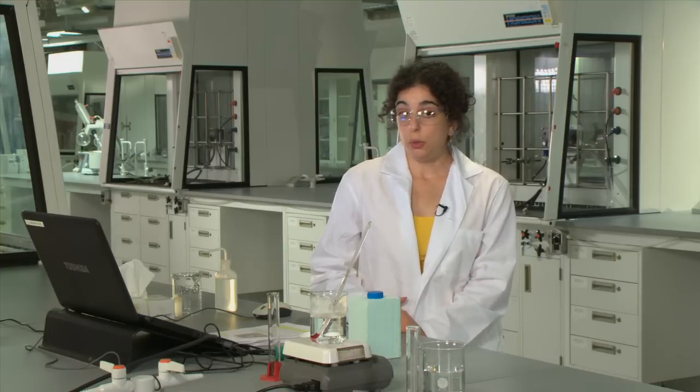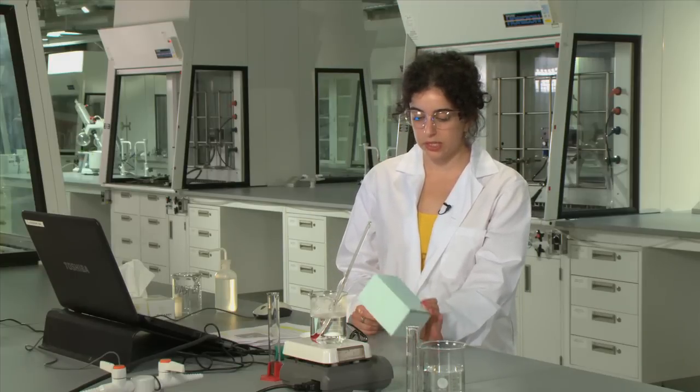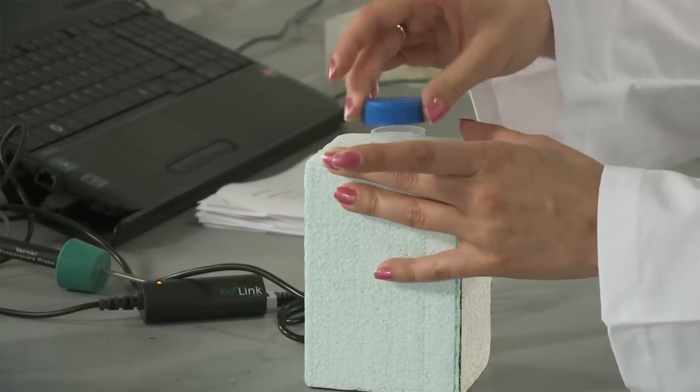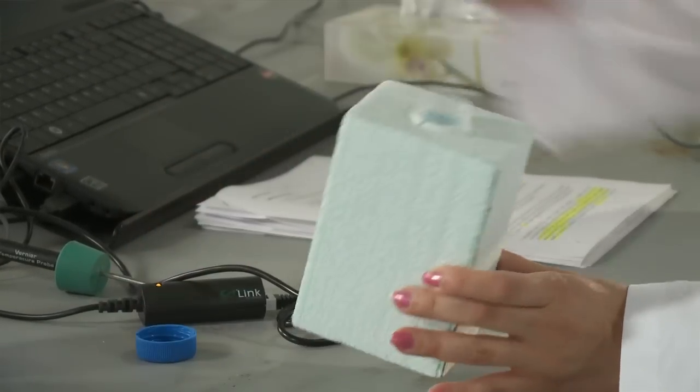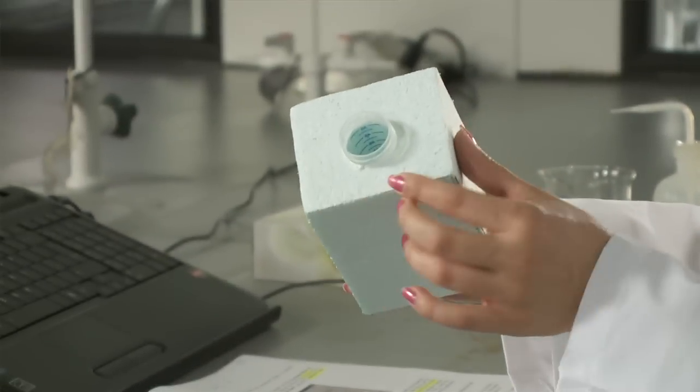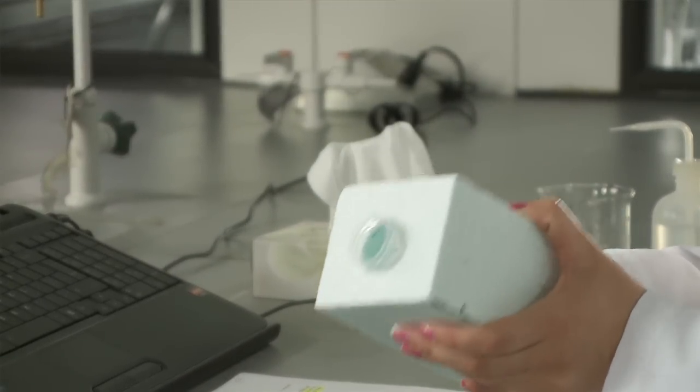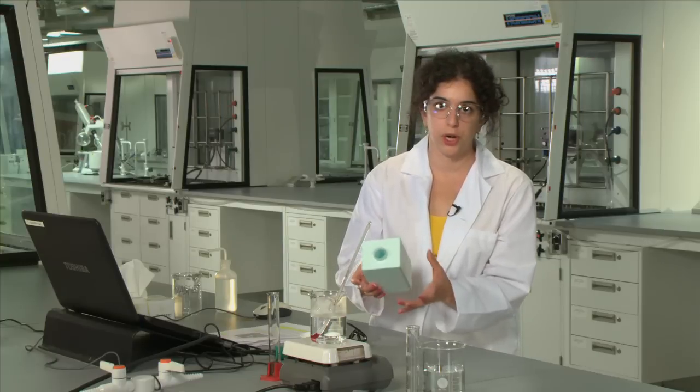The way that you will do this is using a styrofoam based calorimeter. It looks kind of something like this. We've got a tube sort of surrounded by a styrofoam block and the reason we use styrofoam is because it's a good insulator. It's very good at containing heat that's generated by a solution.